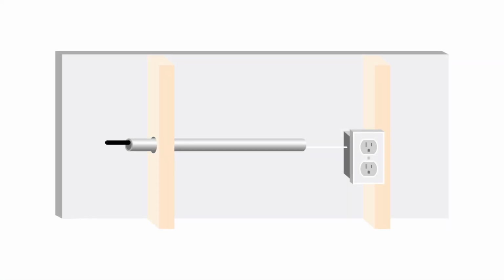For renovations or for buildings that were built in the 60s, that have been rented by 7 different companies, and each one of them has done a renovation to meet their needs, those renovations aren't always up to current electrical standards. These facilities often have significant magnetic field issues generated by wiring and outlets in the facility.